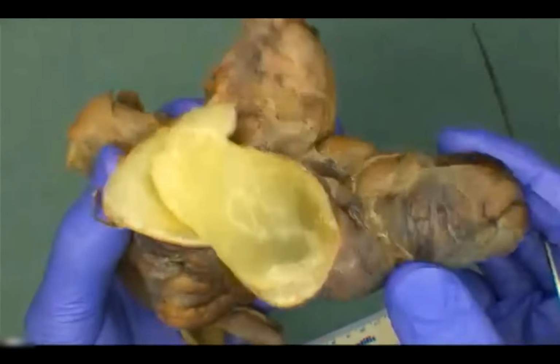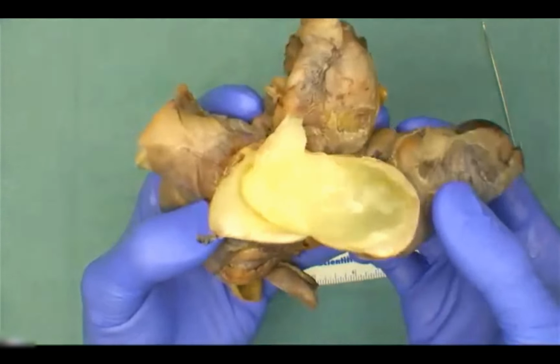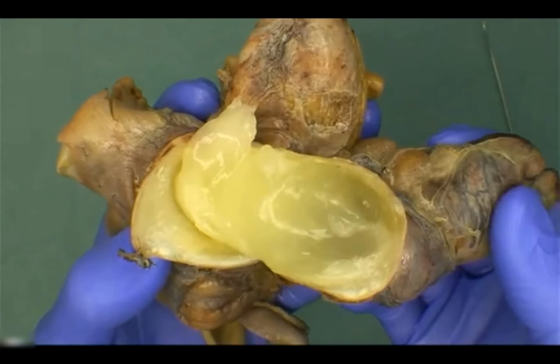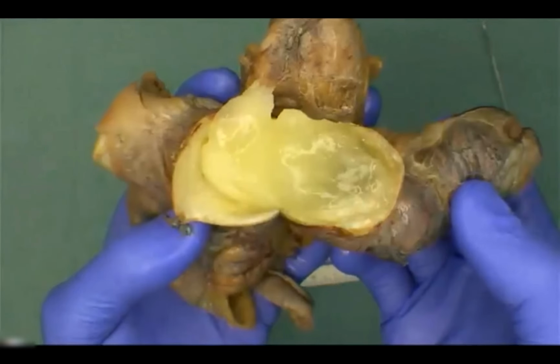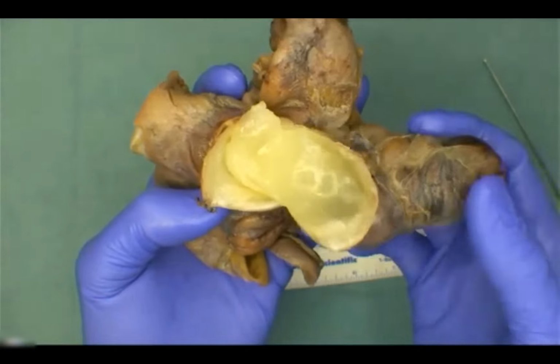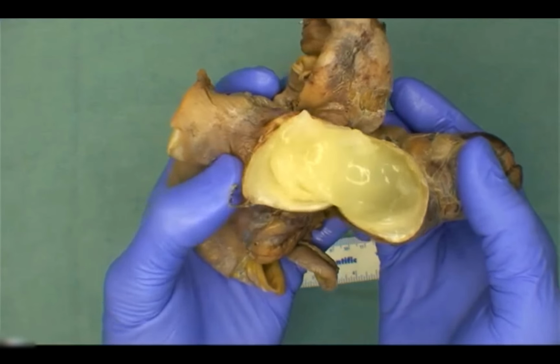So we've only shown just the one cut cross section, but what are some of the elements that you want to be sensitive to in terms of scrutinizing the gross as you handle this across your bench? What are the features we're looking for? What do you want to look out for? Good. Okay. Excrescences, and where would we find those excrescences? Defects are important, and it's important not to transfer a lot of this. Thank you, Brian. That was really giving me a heart attack. It's touching the serosa. Good. Okay. So yeah, maybe some polyps.